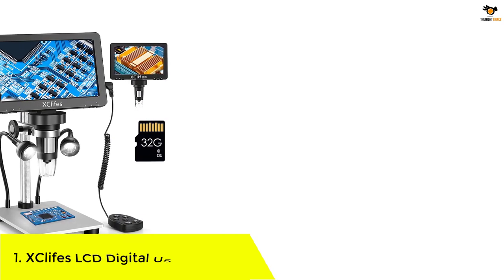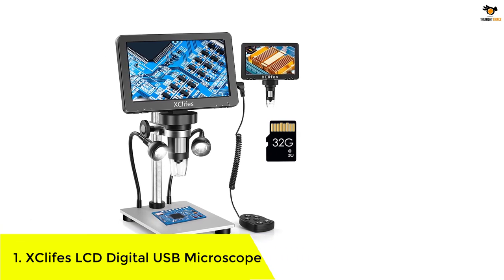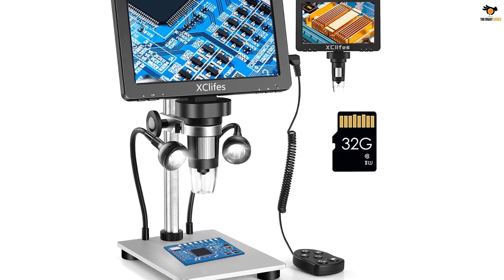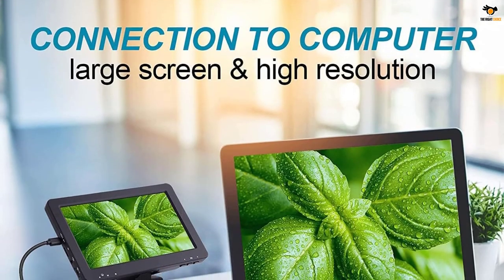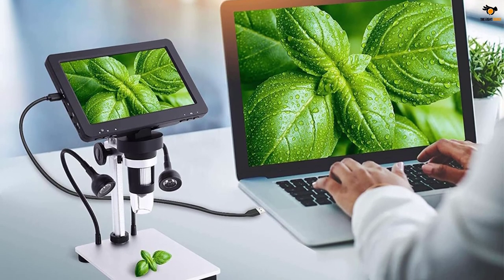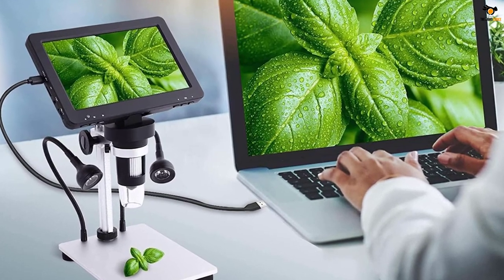Number 1: XC Life's LCD Digital USB Microscope. The XC Life's digital USB microscope has completely changed how I explore the world — it's an amazing device. The camera and clear resolution help me see tiny things very well. The 7-inch LCD screen provides a convenient and immersive viewing experience, making my observations a joy.